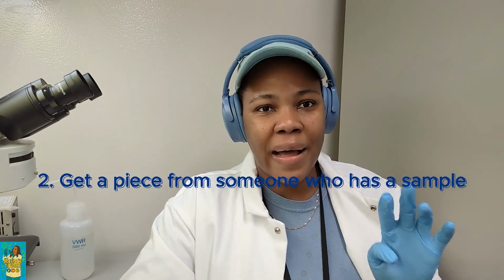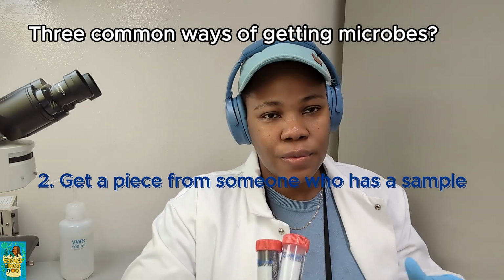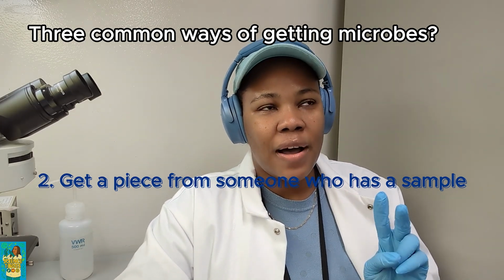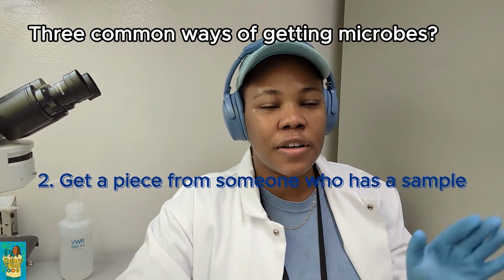Why did I need to go outside to get soil in order to isolate the fungus that I need? So commonly there are three ways of obtaining microbes, whether it's bacteria or fungus specifically. You could one, order it, so buy it from a culture collection bank. They have one in the Netherlands that we use. You have the ATCC, that's an American one, and then you have the Canadian Fungal Culture Collection, and I think that one is probably just for fungus.